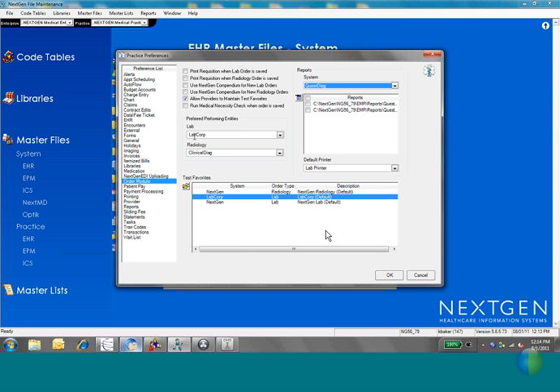All right. So the other part for the requisition, once you have it linked here, there's a checkbox that you can print the requisition when the lab order is saved, or unchecked like I have means that you can print the requisition manually. Same is true for radiology orders, so you have a checkbox for both lab and radiology. I actually recommend, I don't think right now it's working when you have it print when the order is saved. So what I recommend doing is keeping it unchecked, and then you'll save and send the order to the interface, and then you'll manually print it. It's one extra step, but I don't think the other way is working very well, so I think that's what you'll want to do, is keep those boxes unchecked.